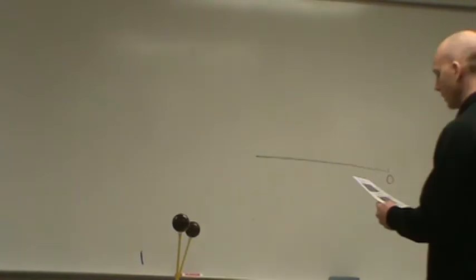Okay, so throw some hints in there. How many peaks are we seeing? 4. Why not 5? Because 0 is TMS. TMS, told you, forget about it. Okay, so never count 0 as a peak. Okay, so we have 4 signals.